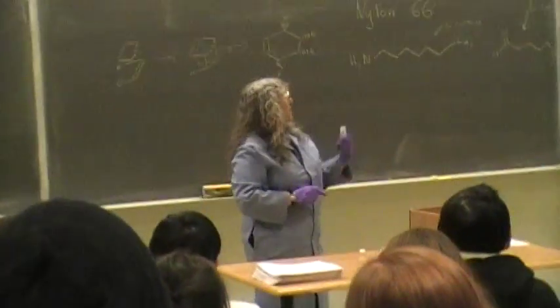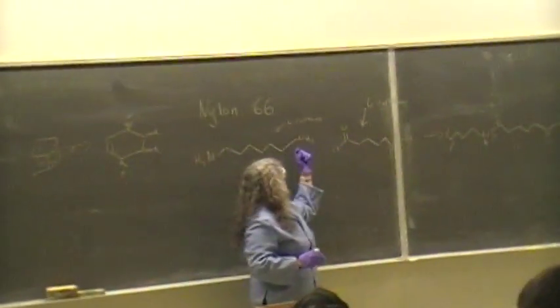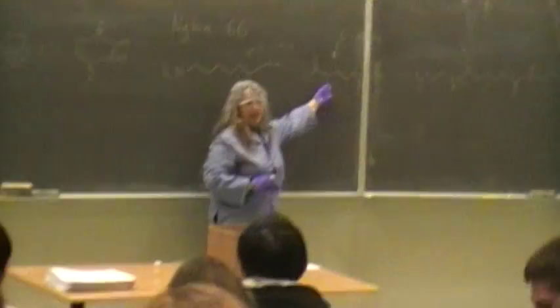And then in this, we've got the acid chloride, which is very reactive with water, but it reacts with this faster. This is sitting in hexanes.